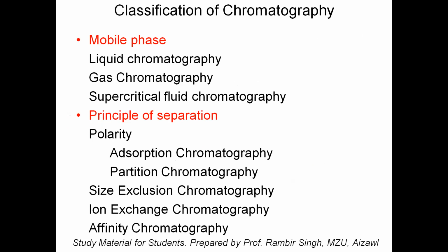Based on polarity, we have two kinds of chromatography. One is adsorption, in which the stationary phase is always solid. It may be polar or it may be non-polar, but it should always be solid in nature. That means the retention is on the surface, not inside the molecule.